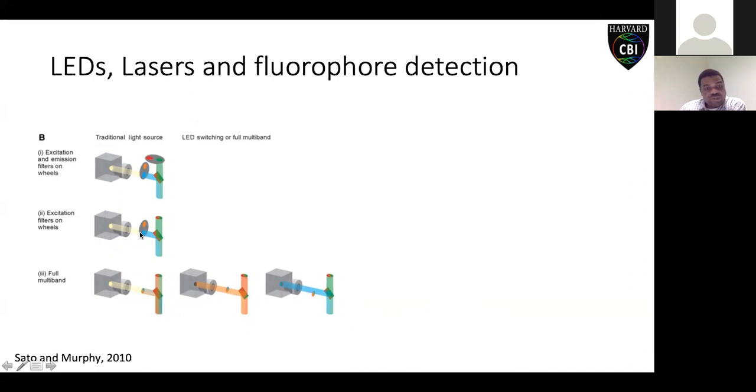You might also have a situation where you have your white light, but because you are getting a very good signal, you would just collect the wavelength right from that particular excited LED. The configuration that is becoming more and more common nowadays is being able to illuminate different LEDs, with or without the excitation filter. As you can see from here, you may be able to remove the excitation filter and collect your sample through, and that is individual illumination of your LEDs.